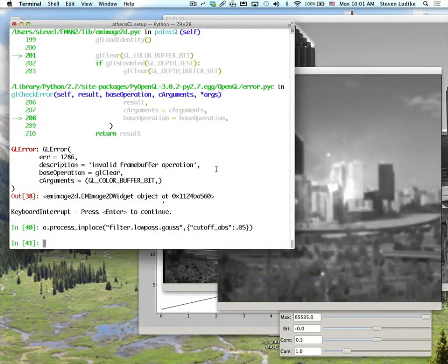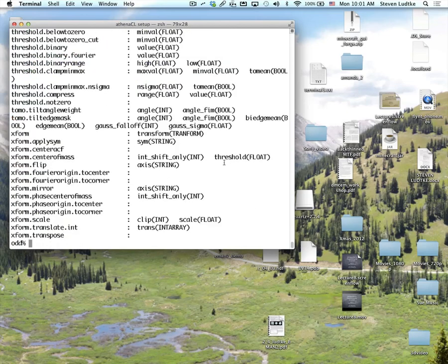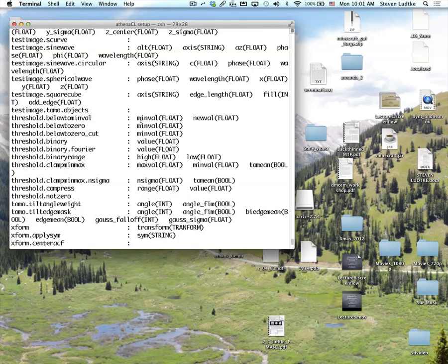And as I mentioned before, I'll go ahead and exit here. I can say e2help.py processors. I can get the list of the processors, and next to the list of processors, it'll have the parameters for each one and what type of parameters, whether it's floating point or integer or string or something like that.